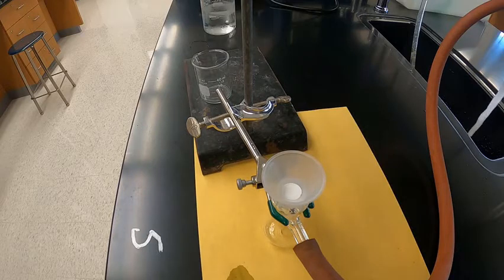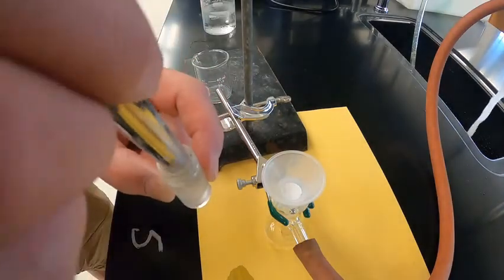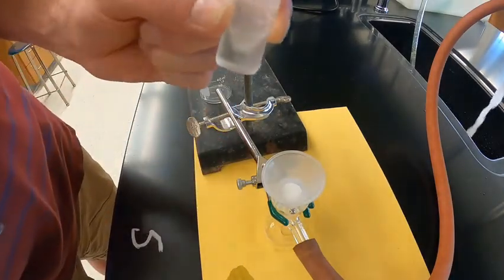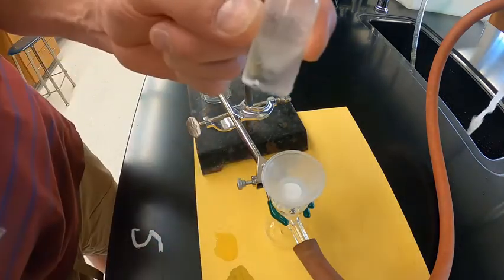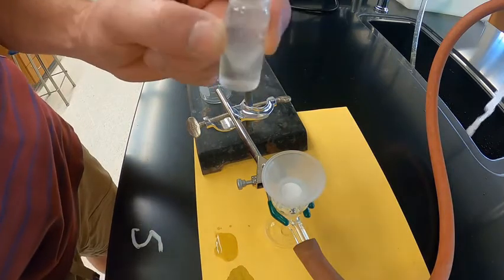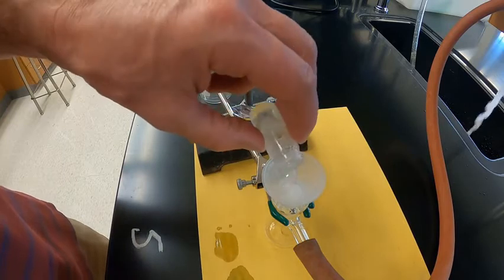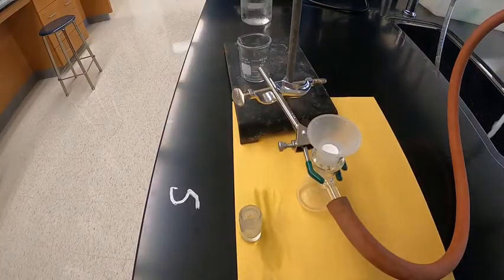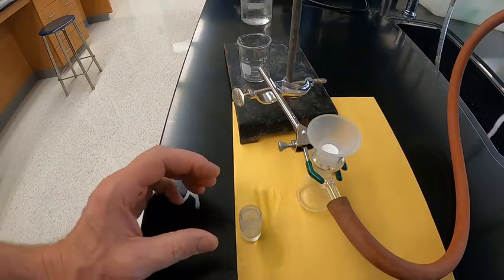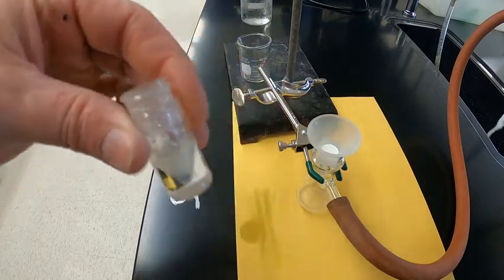So now I have my product vial. I'm going to use my little scoopula to kind of stir it a little bit. And it doesn't seem like much, but all the product is down there in the bottom. So now that it's filtering, I'm going to go ahead and pour it through. So now that we're filtering again, you can see in the vial there's still lots of crystals.